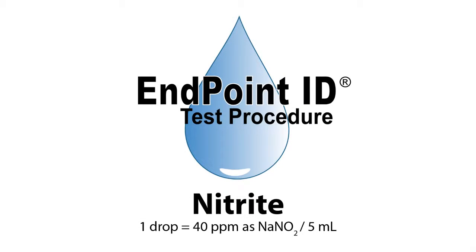This is a demonstration of a nitrite drop count test kit using endpoint ID procedures.